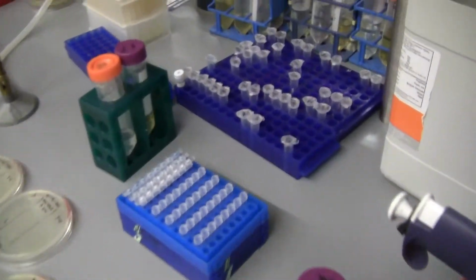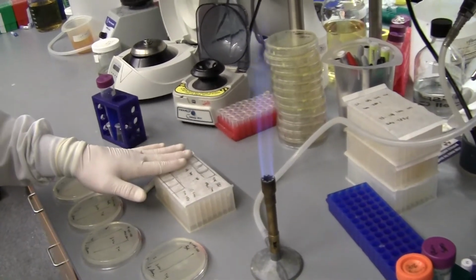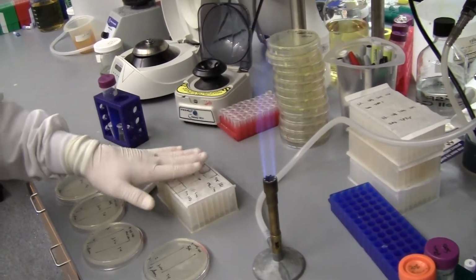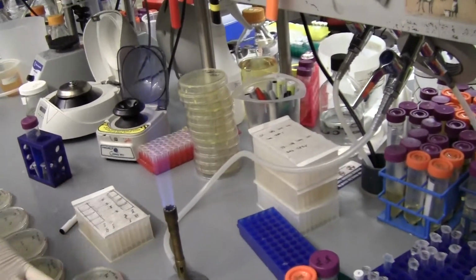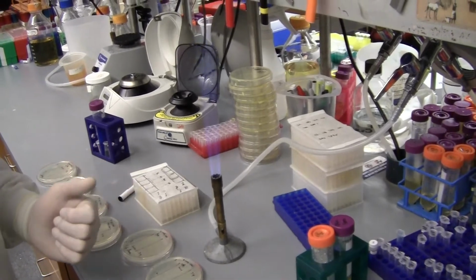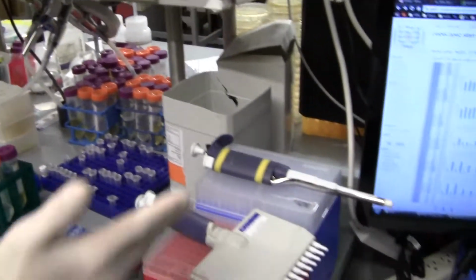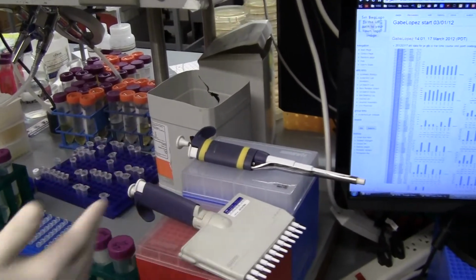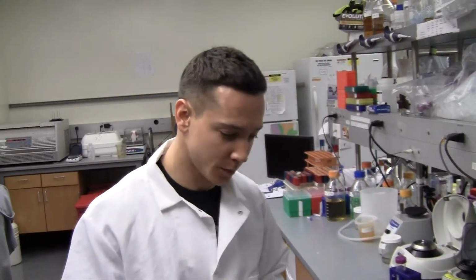I have some overnight culture that is saturated, that we have E. coli, different strains with different plasmids that have grown overnight to saturation. I have my flame. I just want to keep everything sterile here, and I want to use it whenever I'm doing sterile technique. And I have obviously my pipettes, and we're going to be using a multi-channel. I think I've gone over how to do serial dilutions on E. coli before. We're going to eventually be doing something very similar but with phage this time.